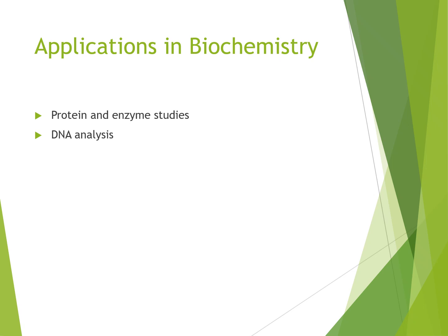It is also a very helpful technique in biochemistry and medicine related fields, and it is used in protein studies and enzyme studies. It is very helpful in DNA analysis, imaging and diagnosis, as the trace concentrations of a sample are studied in fluorescence spectroscopy.